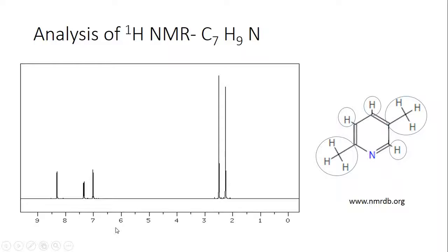So we see some peaks here, all spread out. And we know that we have 9 hydrogens because based on our carbon NMR analysis, we already have a given structure. So we know we have 9 hydrogens, but we only have 5 peaks. And that is because some of the hydrogens are in the same chemical environment, which is shown to the right here with each of these groups. So we have 1, 2, 3, 4, 5 different chemical environments.